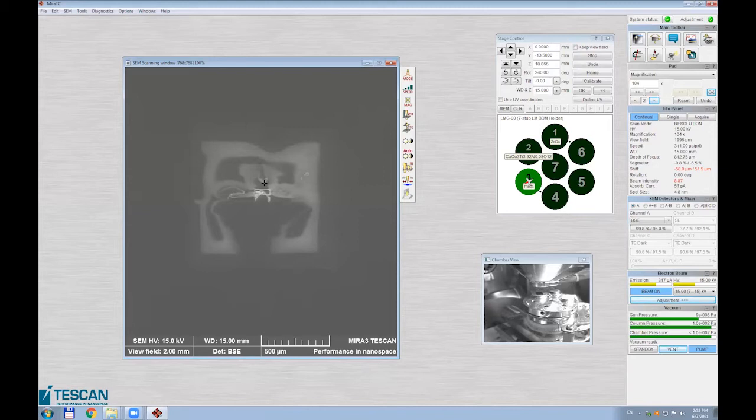So it's not only for material contrast, because for material contrast I rather use EDX to have a direct idea of composition. Something is heavier, so it will be brighter. Something is less heavy, so it will be darker. But by EDX, you have this composition map. So I rather use backscattered electron only for this charging effect elimination. So I will take it out.